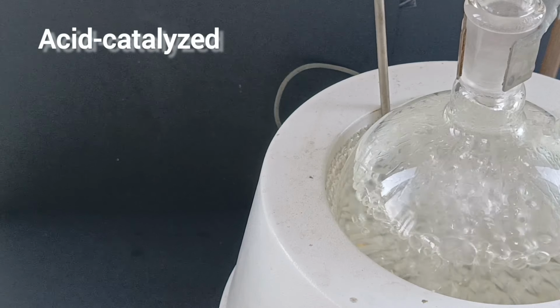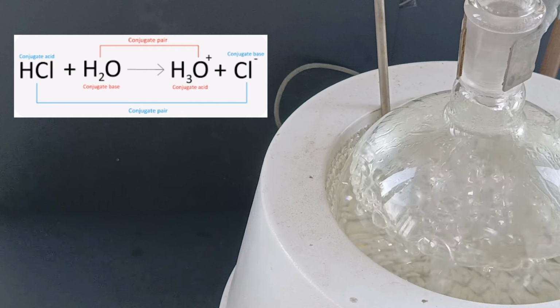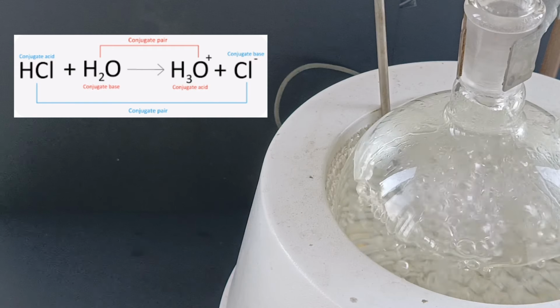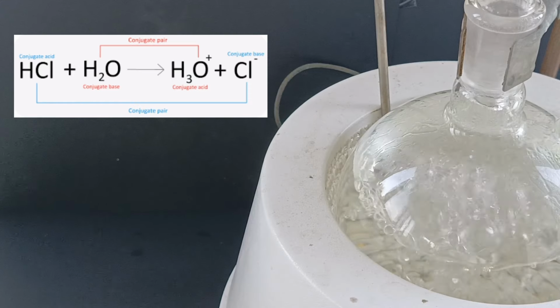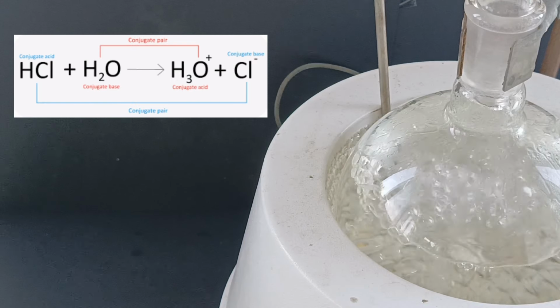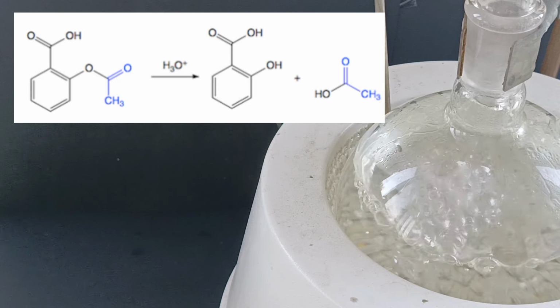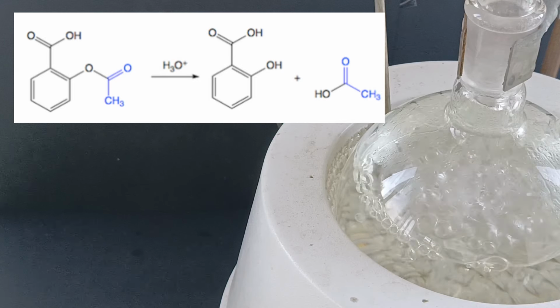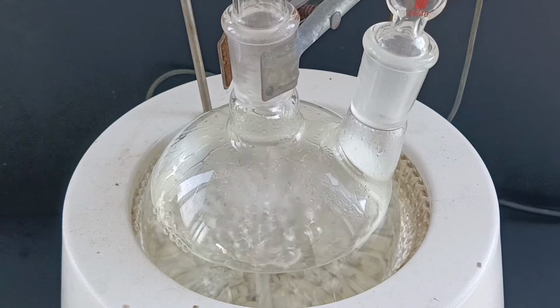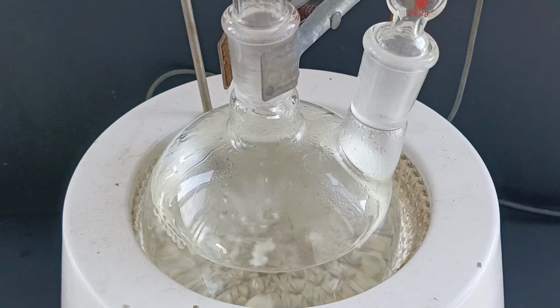The reaction is an acid-catalyzed ester hydrolysis. This is what's going on. The hydrochloric acid dissociates into hydrogen and chloride ions. The hydrogen ions combine with water molecules to form hydronium ions, H3O+. The hydronium ions then catalyze the hydrolysis of aspirin, breaking the ester bond and forming salicylic acid and acetic acid. The formation of acetic acid is why the mixture smells strongly of vinegar during the hydrolysis.